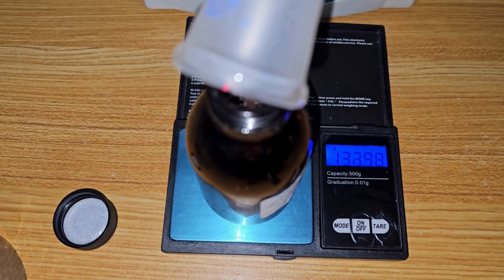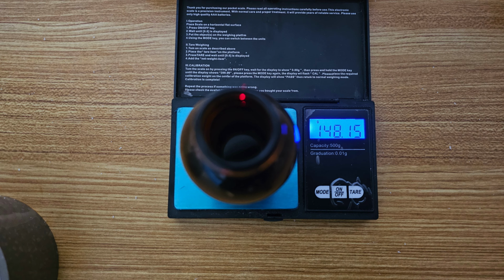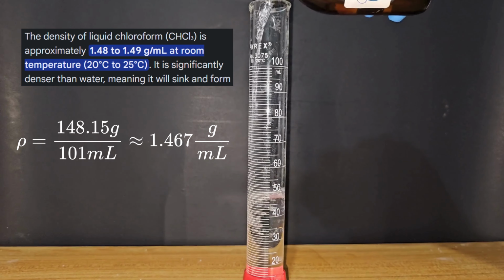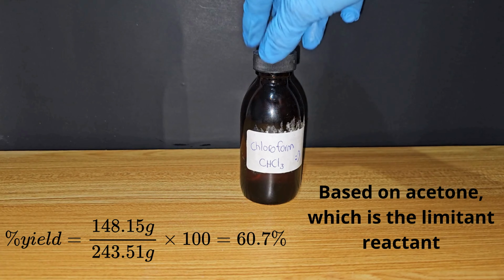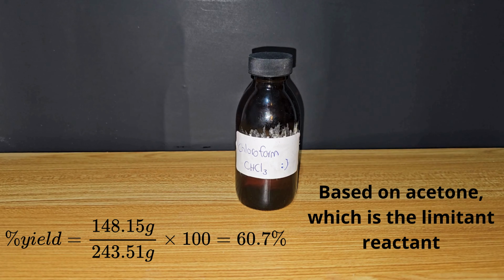I weighed the distilled chloroform and in total I got 148 grams. I measured the volume and dividing the mass by the volume, I got an experimental density of 1.467. In the end I got a yield of 60.7%, which is not bad for me.